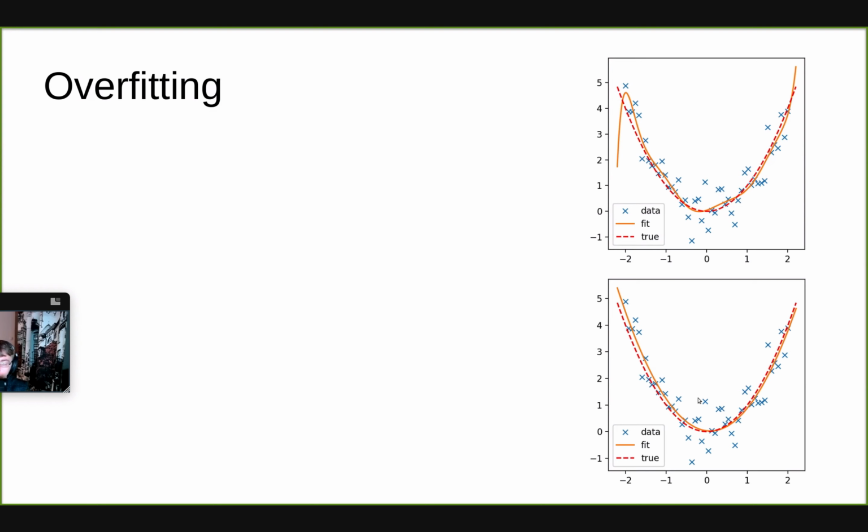But if you choose the correct number of parameters, then you can get a good fit even into noisy data. And the way that you usually monitor and test if your model is overfitting is that you split your data set into several different sets.